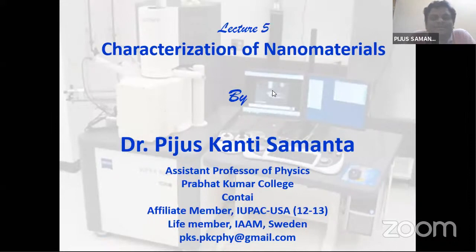So welcome participants to the 5th lecture of the lecture series. In the last lecture, I discussed the characterization processes of nanomaterials. Mostly I discussed X-ray diffraction to study the crystallinity of the material, types of unit cells, particle size, strain, etc. That is the first check we should go for, whether a sample has been prepared or not. So we should first go for X-ray diffraction checking that our crystalline structure is formed.